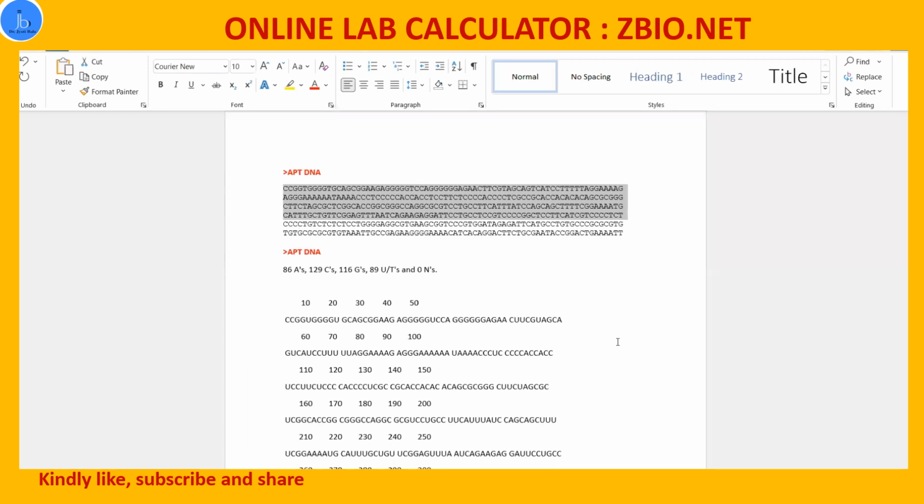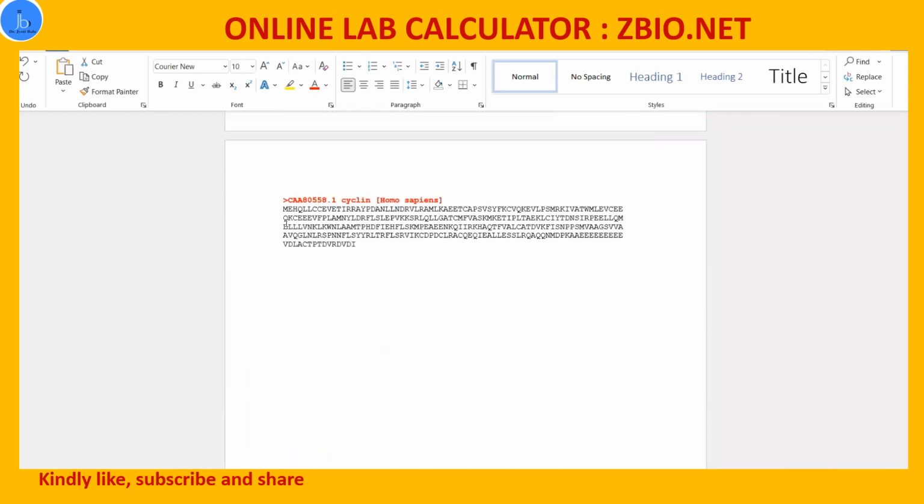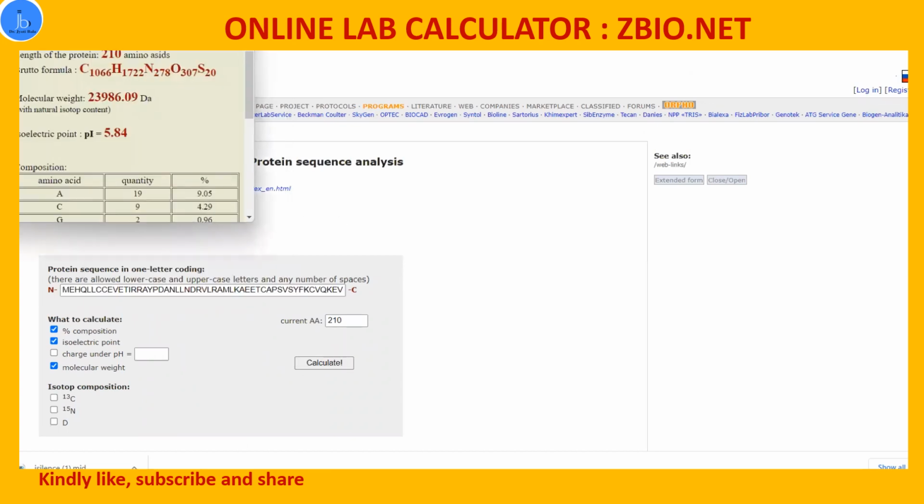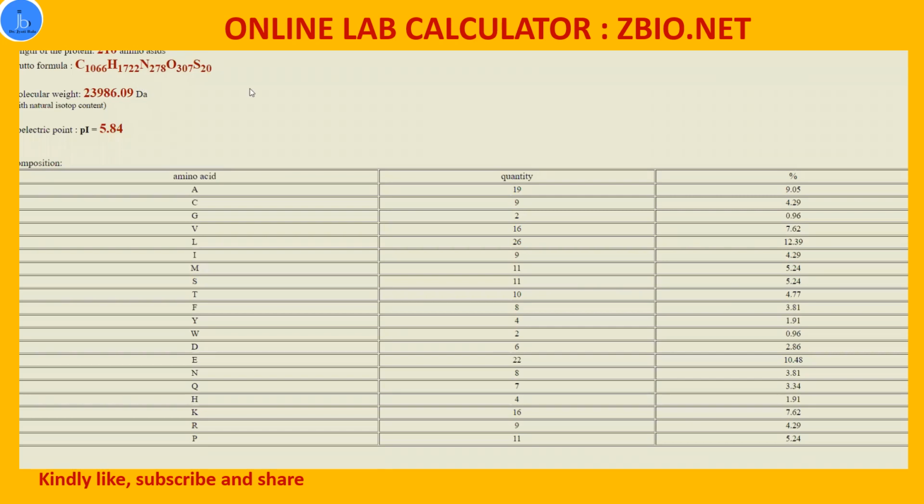So let's take some example of protein also. I think I have a few samples. Here you have to paste your protein and then calculate. See, they're giving you the amino acid and protein composition, the chemical formula, molecular weight in terms of Dalton, and pI values. These values are very important when you are performing affinity chromatography, or you may be running the gel related to protein. Depending on these values, you decide the beads, the column, and your gel also.